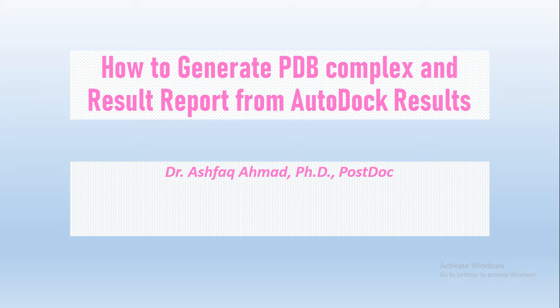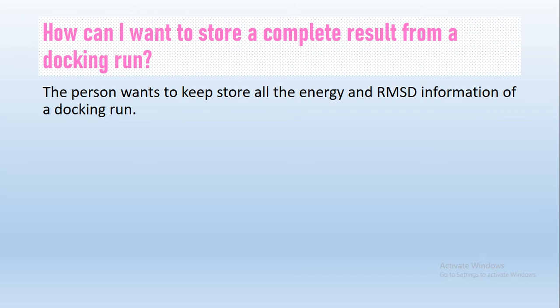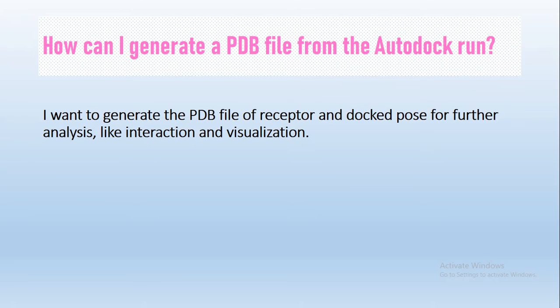The questions include how to generate a PDB complex file from the Vina result, how to generate a complete record of the energy of the docking result, and I will also teach you a few simple tricks to use AutoDock. This will be a shorter video, probably less than 10 minutes. The first question is: how can I store a complete result from a docking run? The second question is: how can I generate a PDB complex file for further analysis like visualization and interaction from the PDBQT results generated in AutoDock Vina?